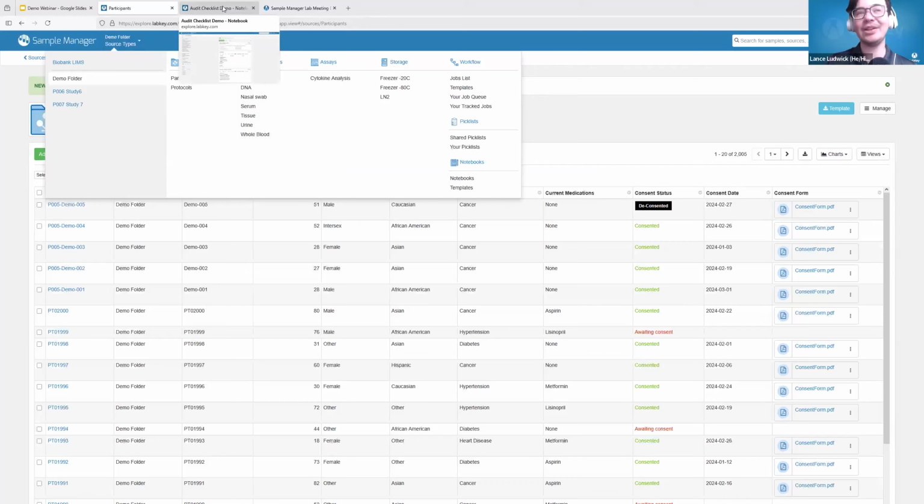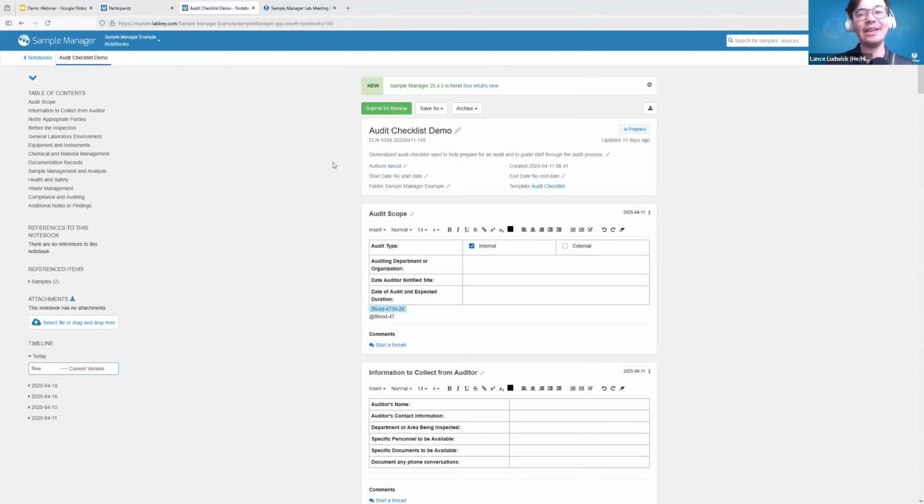And then another thing that I'd love to cover are our ELNs. Our ELNs are a great way to not only keep track of your experimental notes and collaborate with everyone in the lab, but it's also fantastic to help replace any paper records that you may have, because paper records are really easy to lose or to ruin, or, scientists don't necessarily have the neatest handwriting, so it also helps with that.